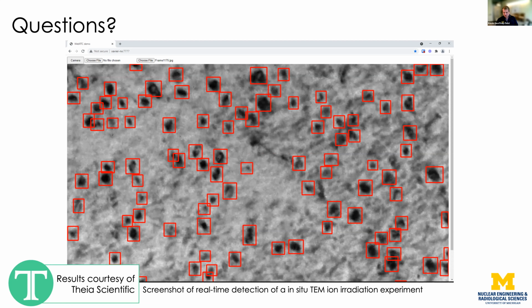Yeah, great question. Yeah, it totally can. So we typically will use a PFIB, plasma FIB, for primary trenching, because it's just so much faster, right? And then we do the gallium FIB for low energy final thinning in that process. For a typical FIB system, which you can start deducing that Michigan has many of these, they run at 30 kV with gallium ions. That will impart these little black dots that you see in this image, or it can.